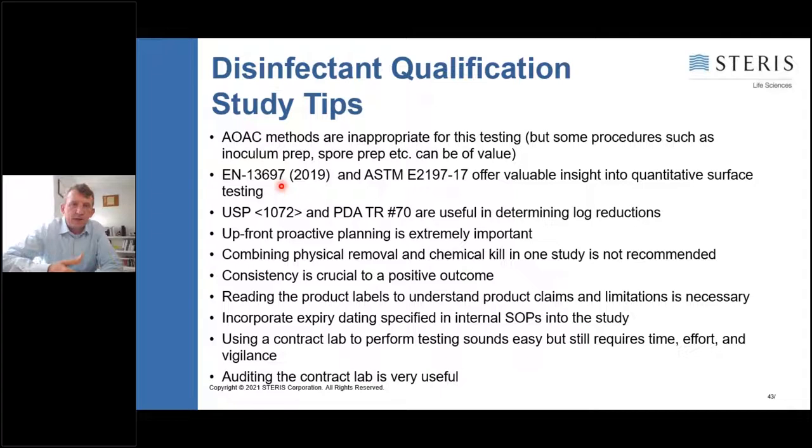The EN13697 hard surface method, for example, or the ASTM2197 quantitative carrier test were designed to be hard surface tests, designed to give you quantitative log reduction values, and are much better fits for this type of testing. Jim talked a little bit about log reductions and looking at some of the different references for establishing your correct log reduction pass-fail criteria. Again, that upfront planning is extremely important for these studies because they can be time consuming and very expensive.